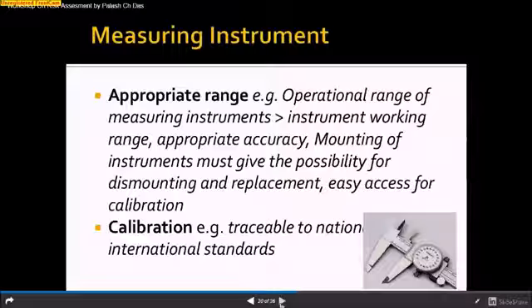You should have traceability, you should have documents, because auditors see documents, not the efforts that you are making 24/36. They need documents. When we discuss documents, we can say the component certificates, for whatever components are in the machines. Operational manual is also important: machine maintenance manual, then SOP for cleaning and operations, training for the relevant staff, and preventive maintenance. These are also important portions. Once you have good maintenance practice for your machines, they will work for you for a long time.